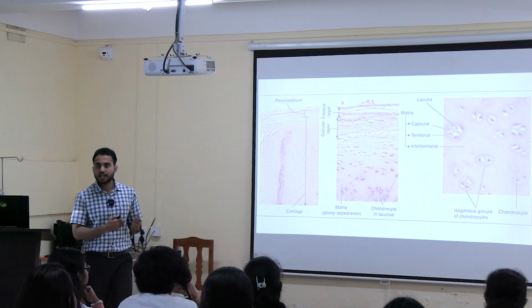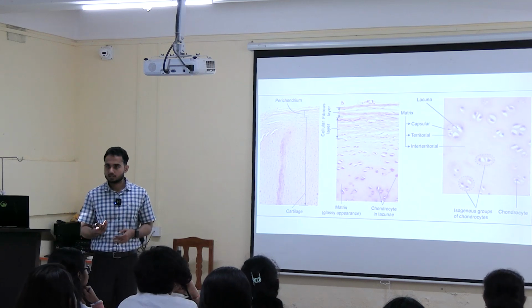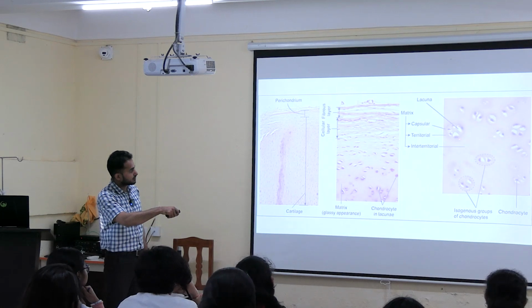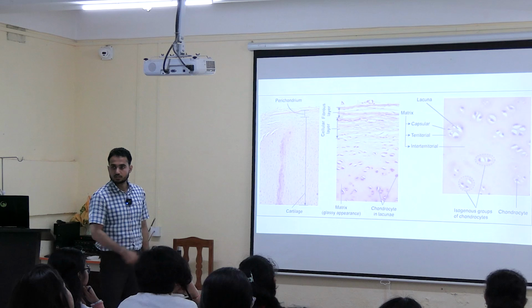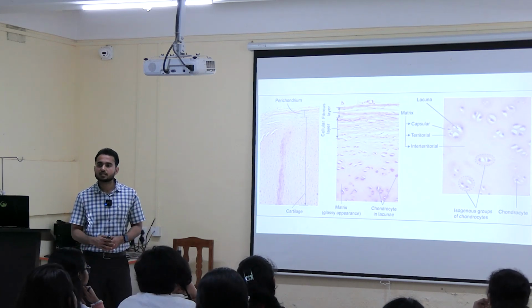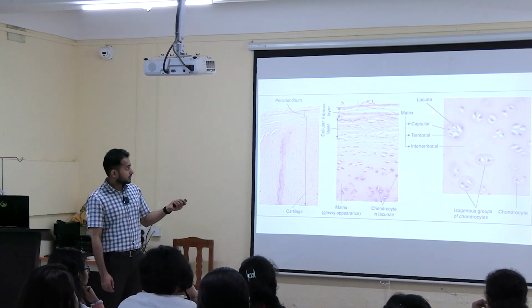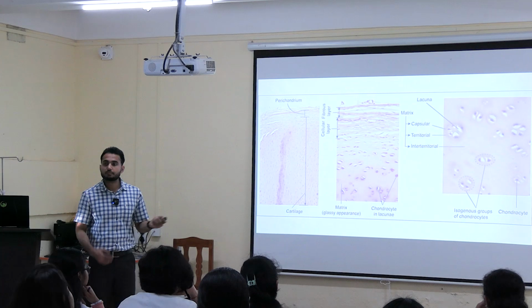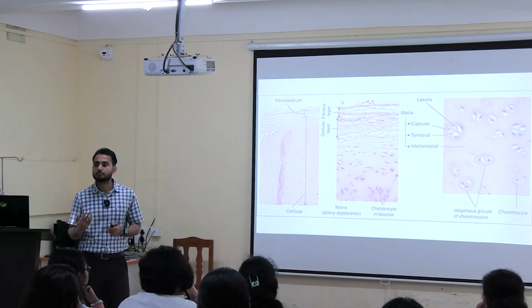Some part is brighter, some part is darker. Can you see the difference? If you focus over here, see this particular area, it is more darker. See this area, this is brighter. Can you see? Now why is the appearance like this? Three different types of matrix are there, depending on how they appear.